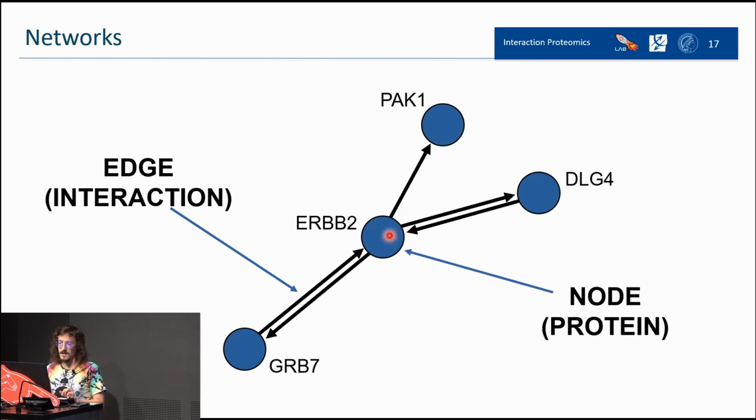Usually all of the circles are nodes, but the one in the central part of the network is the one that you use as bait. Or let's say the central part of the network is the protein whose interactions you are describing. And then we have edges, these lines that could go from one side to the other. For example, this edge means that the interaction happened only between this protein and this one, but not vice versa. Here instead, both of them are interacting.